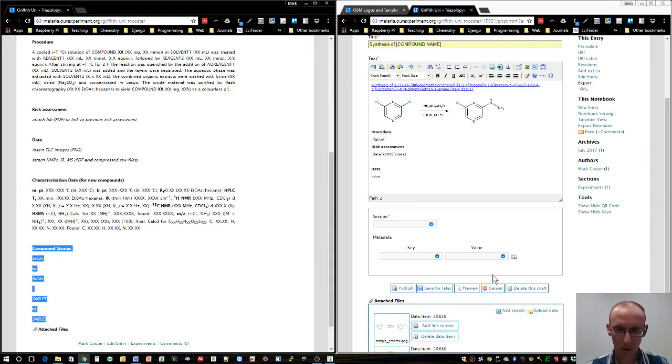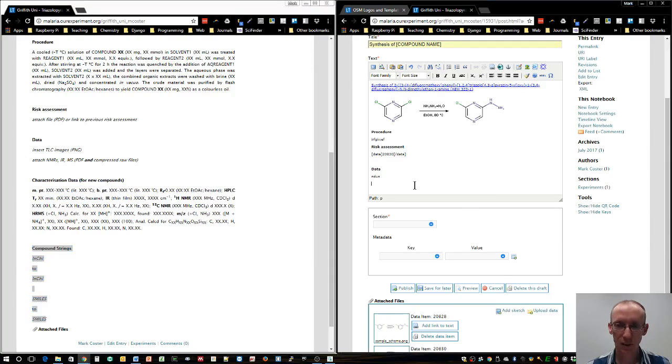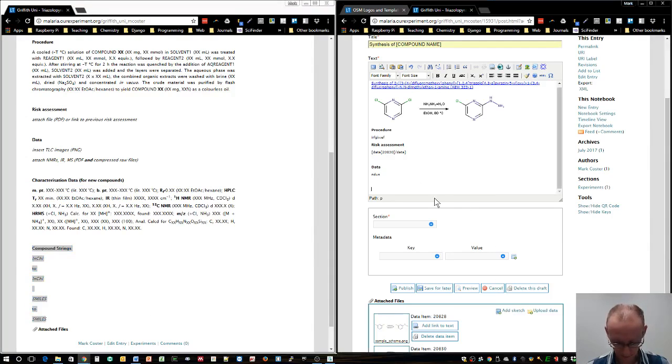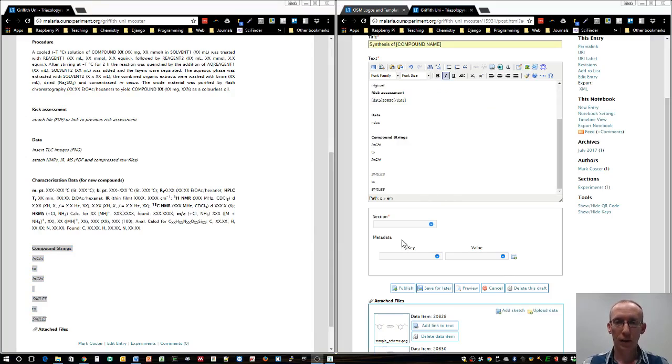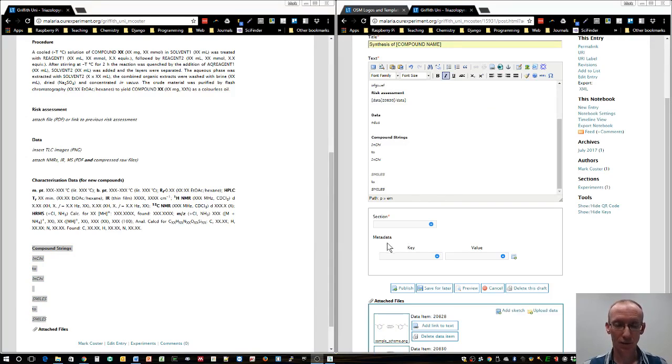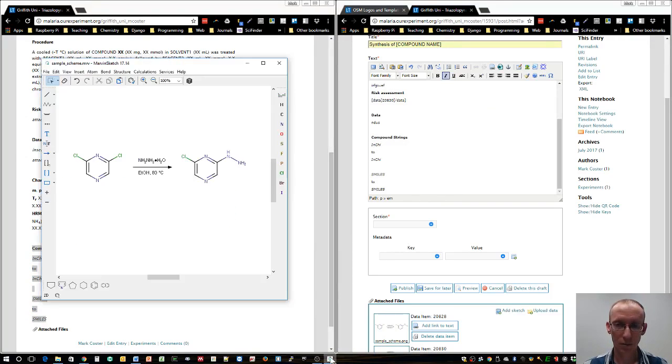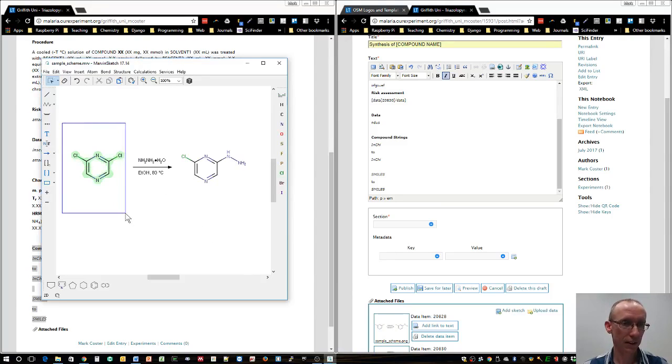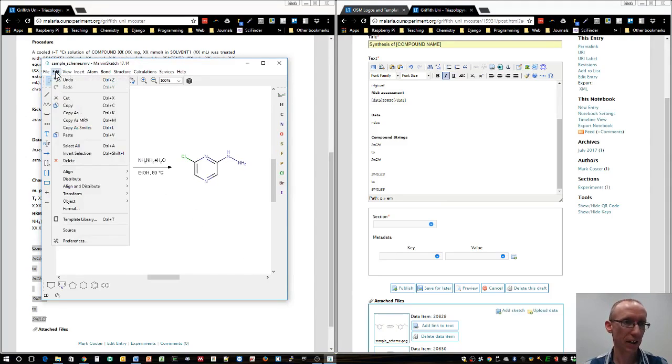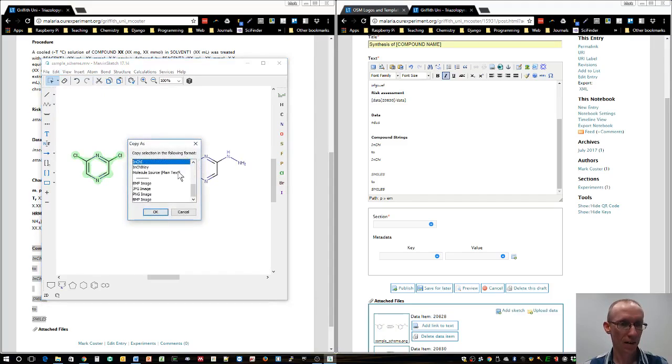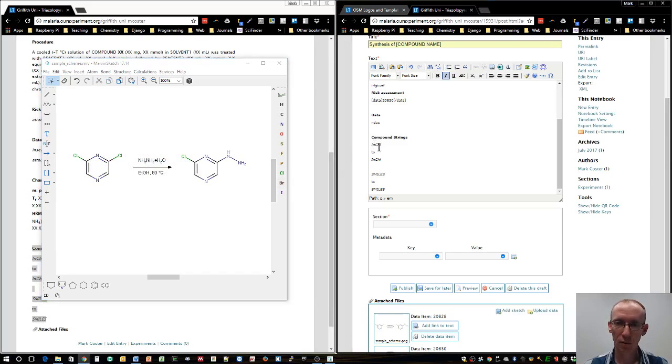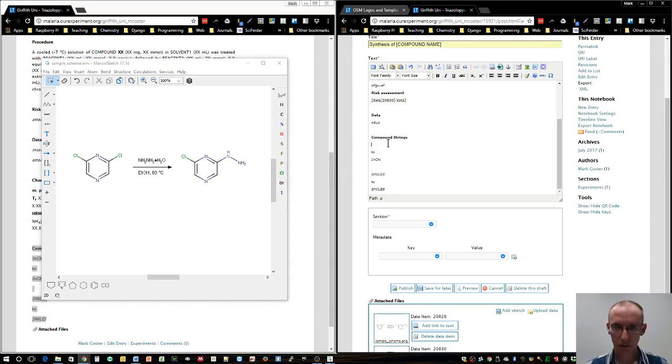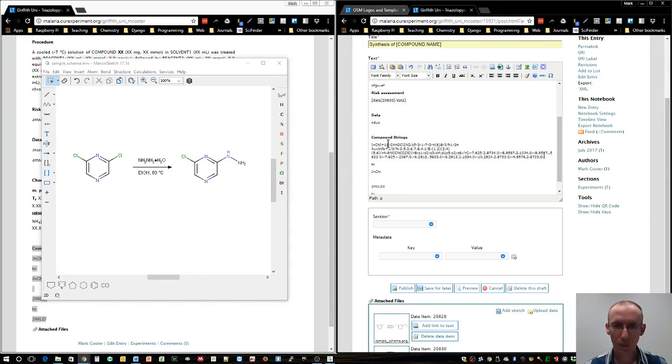We'll have a section for that in our lab notebook entry. We'll paste in those strings from using Marvin. We'll select the starting material and say edit as, copy as, and then go down to INCHI already deselected. That's copied it to the clipboard. We'll insert it in this position here, click and select it, get rid of that, and paste.